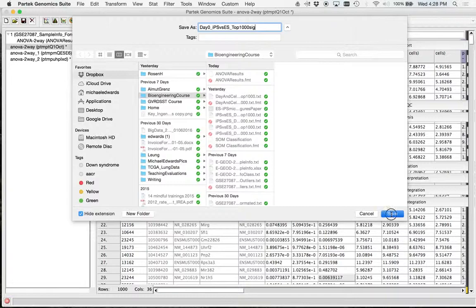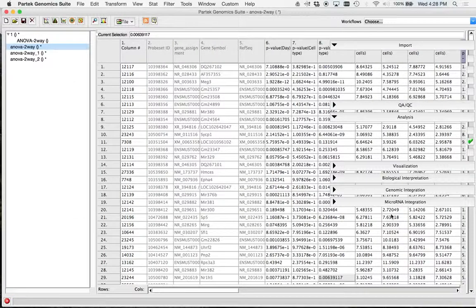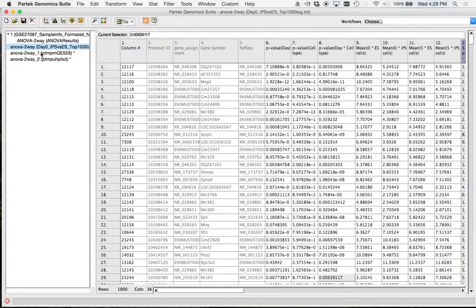Hit save. Everybody with me? Anybody having problems? No?